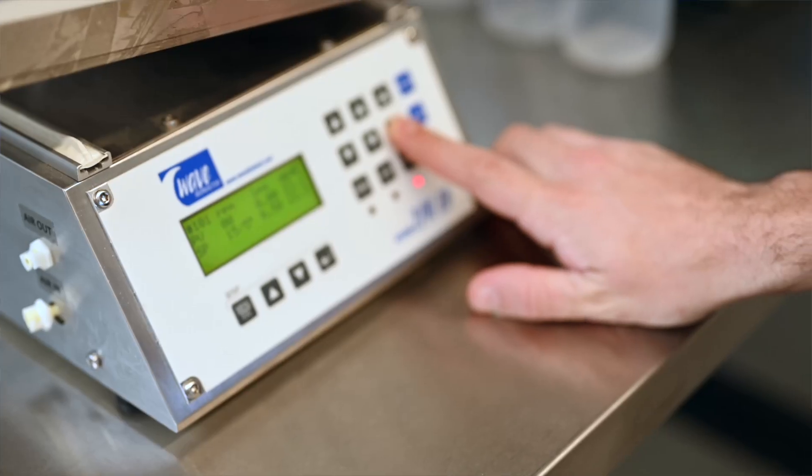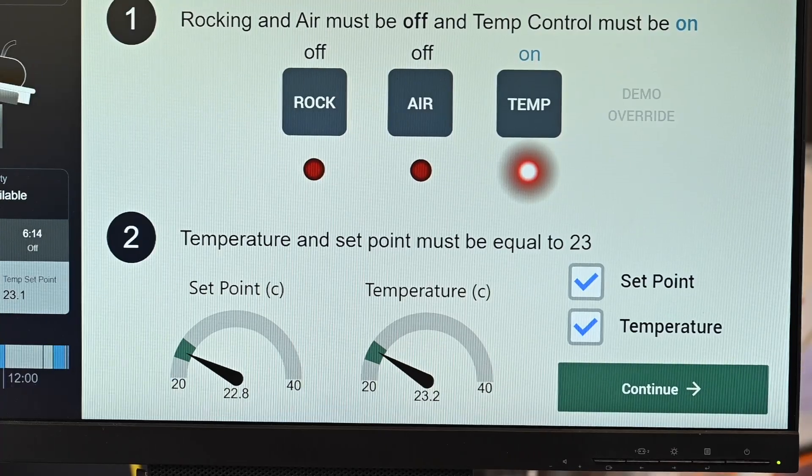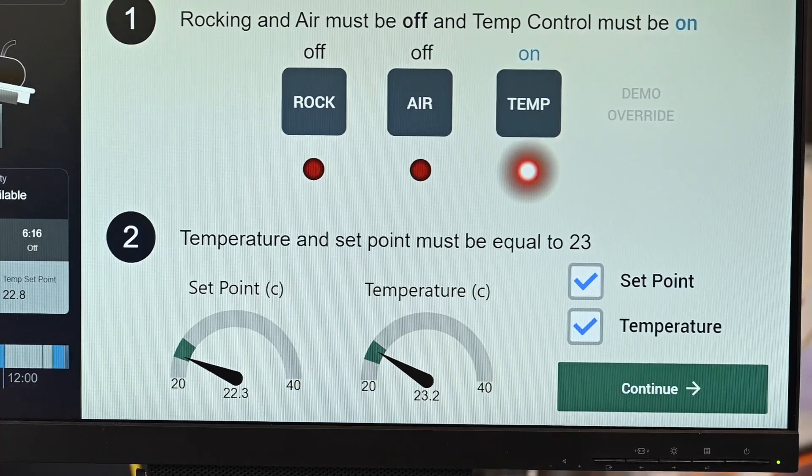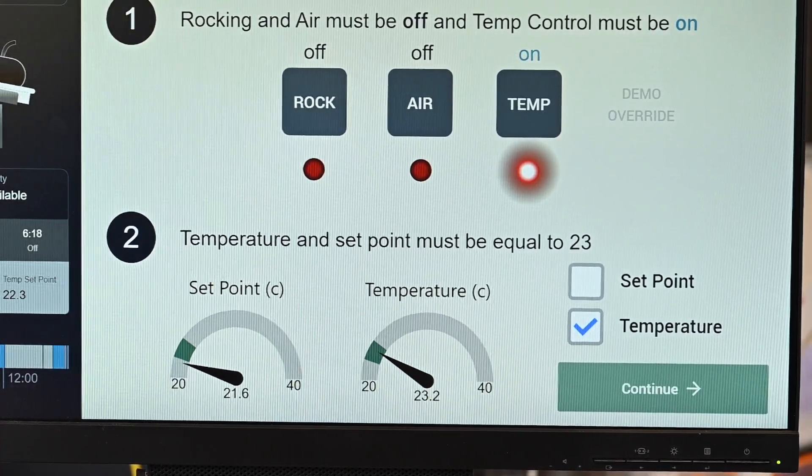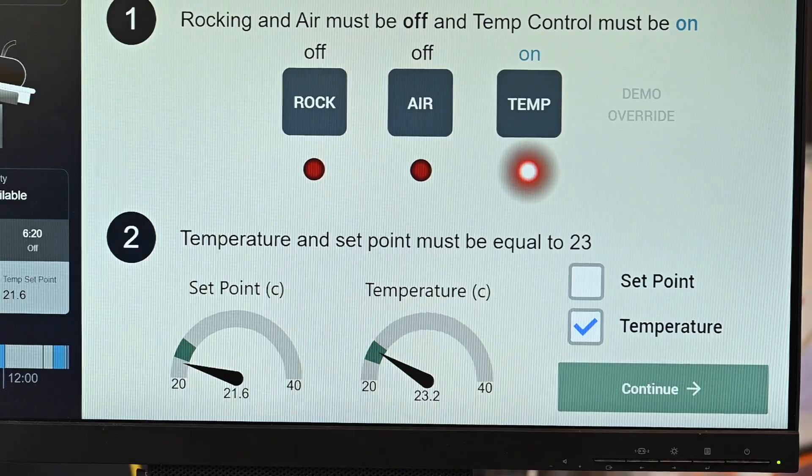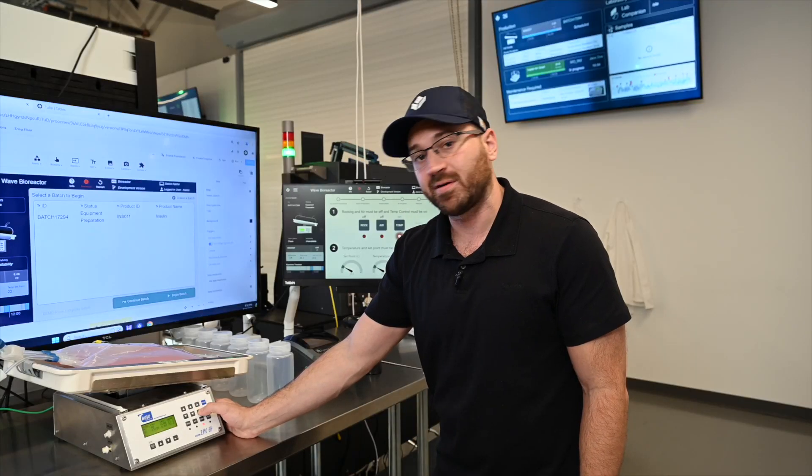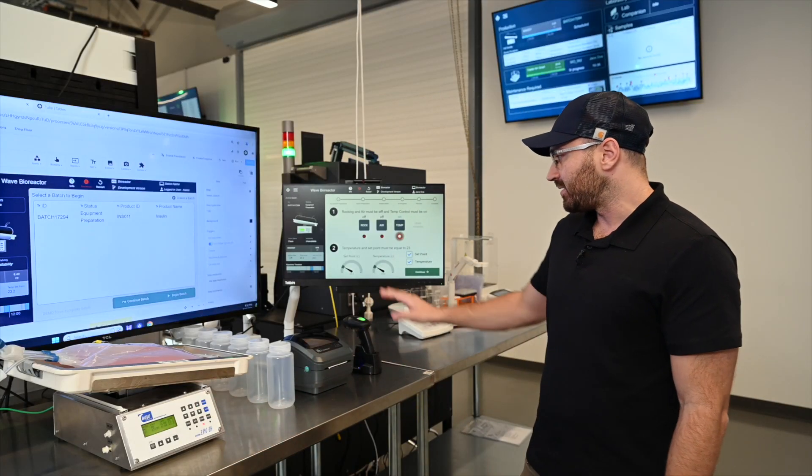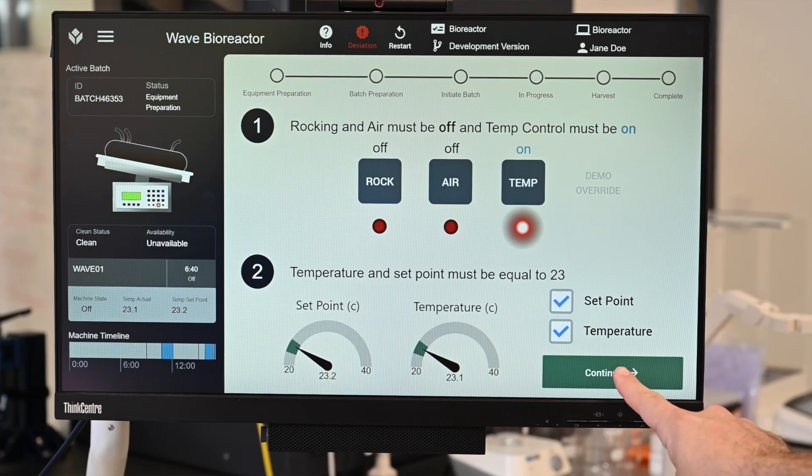So if I move my temperature, for example, down, you'll see the set point is moving out of range, basically enforcing that the operators are able to set the equipment to match the requirements of the production. So now that everything is set, I can continue.